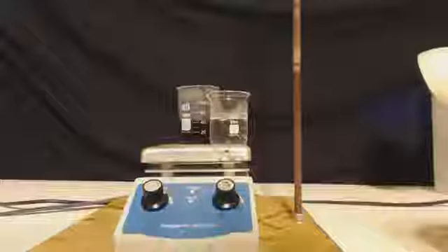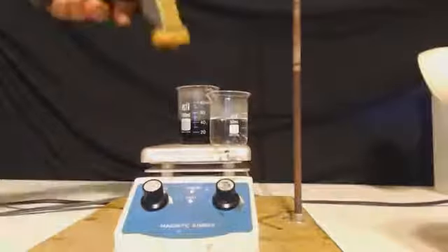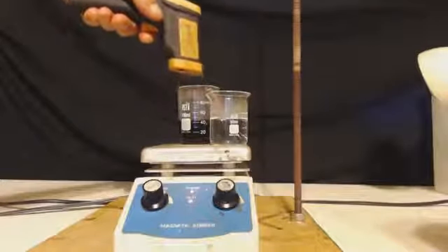So I took 5% of that 800 milliliters, because my objective is to make potassium dichromate, not chromium chloride. So I took a little bit out just to show you. Basically, what you do is get it saturated and almost boiling, and at that point, take it off the heat, let it cool down, and then put it in the freezer, but don't let it freeze. And whatever crystallizes, filter it off, and there's your product.